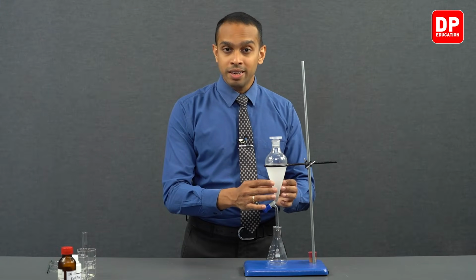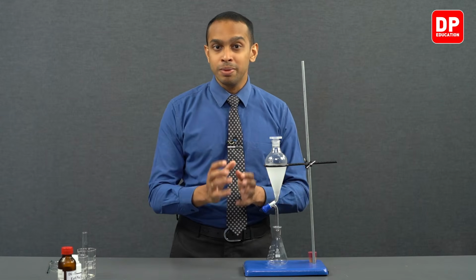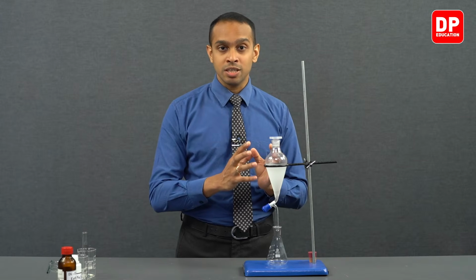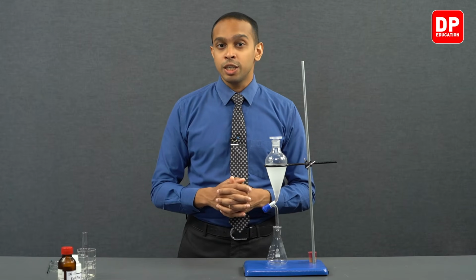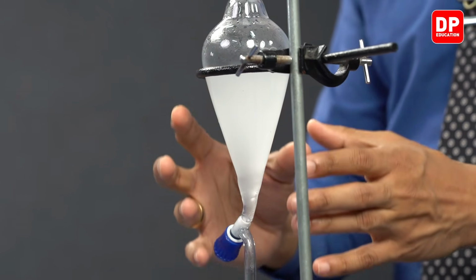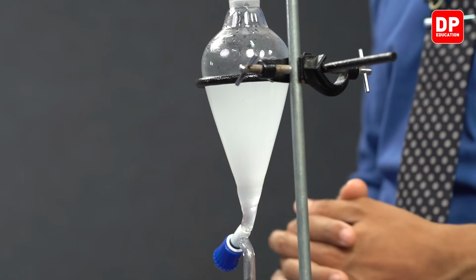Since we used cinnamon leaves, the main component of the essential oil that we have here is eugenol. This particular essential oil is not very soluble in water. That's why you can observe this cloudiness in this aqueous mixture.